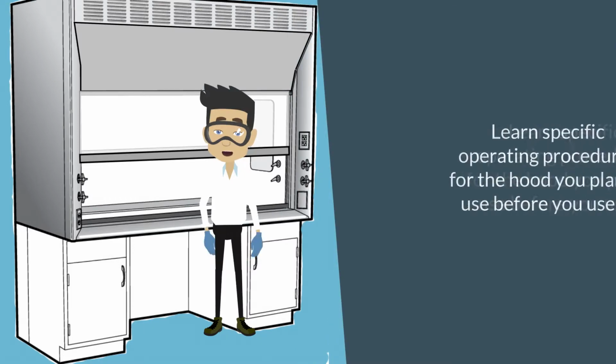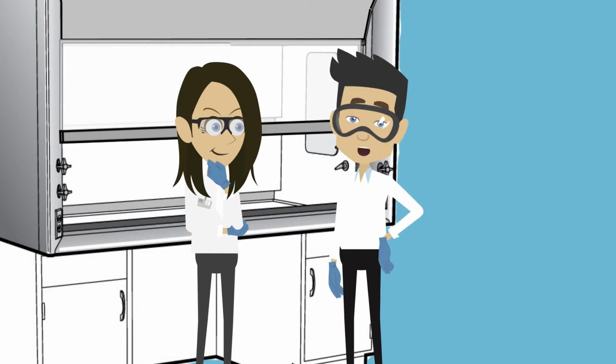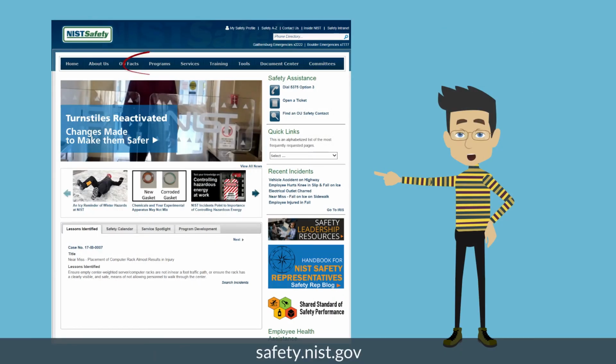During this video, I only covered general safe practices, but before working in a hood for the first time, you should be trained on how to operate that specific hood properly. If you have any questions about your fume hood, talk to your supervisor, your group or division safety representative, or contact the Office of Safety, Health, and Environment. Also read the fume hood safety requirements in NIST's chemical management program located on the safety website.